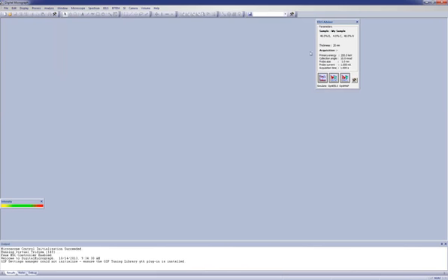You can see that the palette can be summarized by this box item here that has the parameters that are used for the software. The user can specify an arbitrary sample. In this case, it's the default that we have when the software first runs: boron nitride with a trace amount of carbon at 20 nanometers thickness.